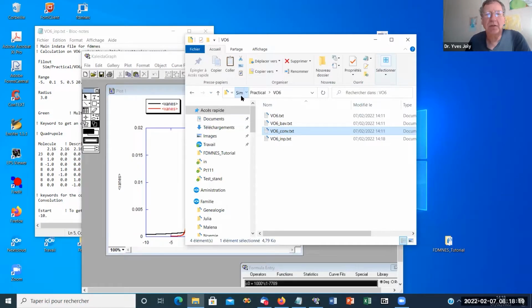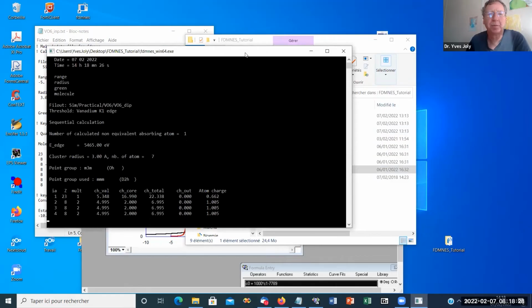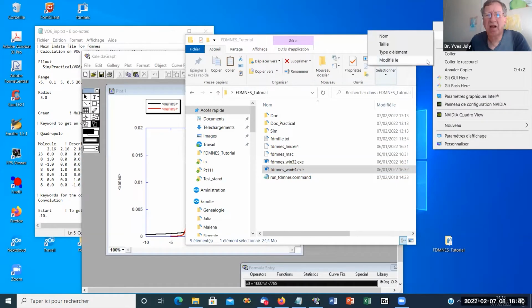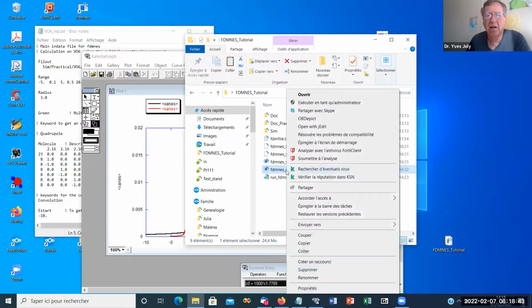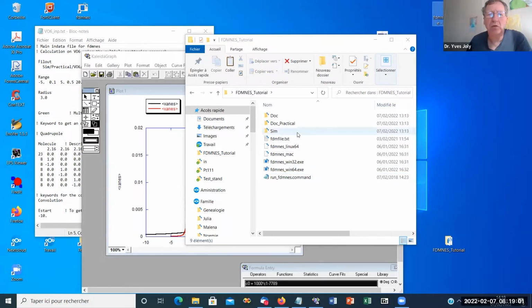So just click here. Okay, just to click more quickly.